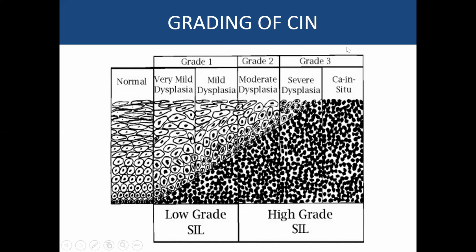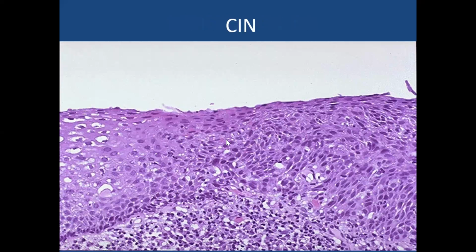So now with the CIN terminology, when you say CIN, then you know that we're referring to these abnormalities, which can be graded 1, 2, or 3, and it's one thing, rather than having dysplasia, which starts from 1, 2, 3, and then the fourth one is not dysplasia, it has a different name called carcinoma in situ. I hope so. Now let's look at real histology here.